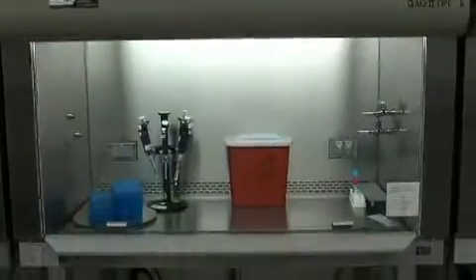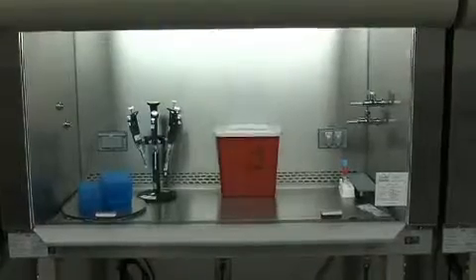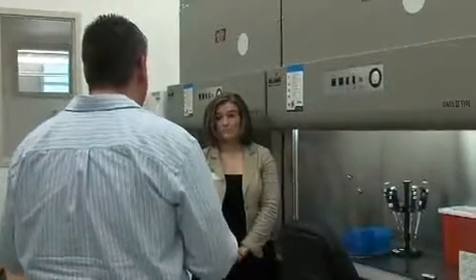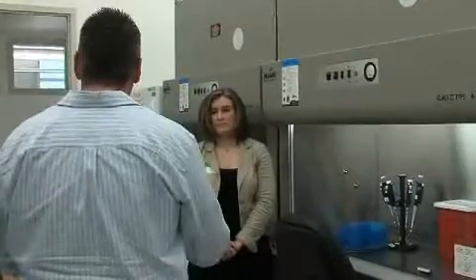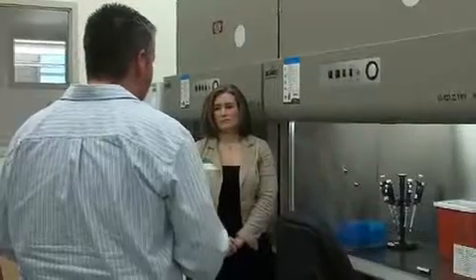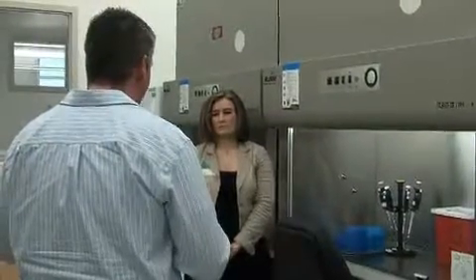So once we've quantitated the amount of DNA that we have using the 7500 instruments, the next step is to come in this room. In our old laboratory, we actually had one of these hoods, so it was shared amongst all the DNA analysts. With this room, we developed it with 5 hoods so that multiple people can come in here and set up their samples at the same time.